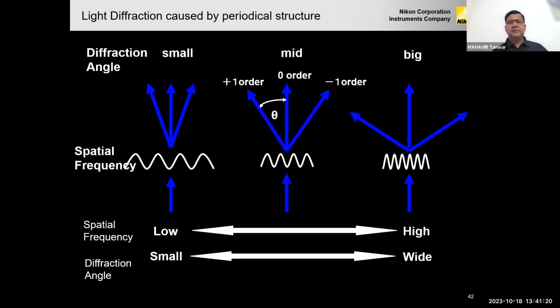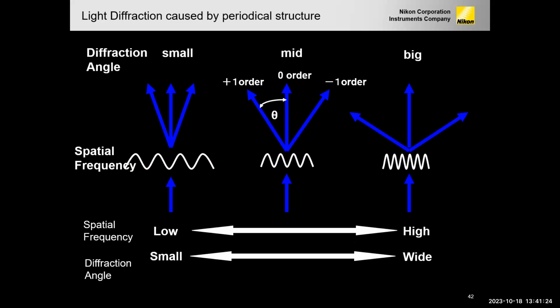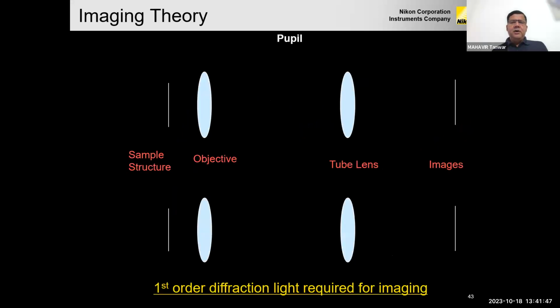Right. Yes. And because it is wider, of course, a wider NA is what we need. A low NA will not work, even for something that is going very close to the object, it will not work. Correct. And our challenge is to bring back this information into the NA. Okay. Right. So you want your objective to capture all those lost information. Correct. So that is how the imaging works basically.